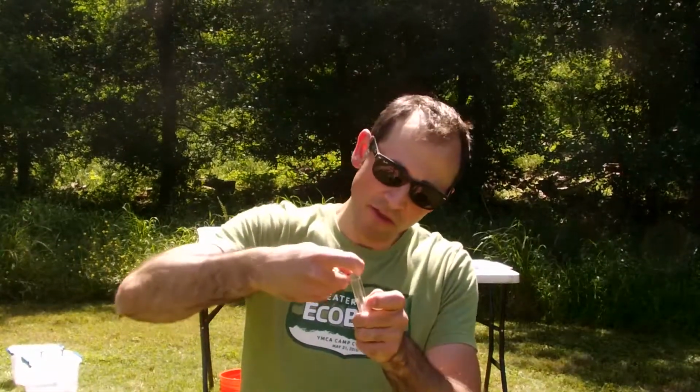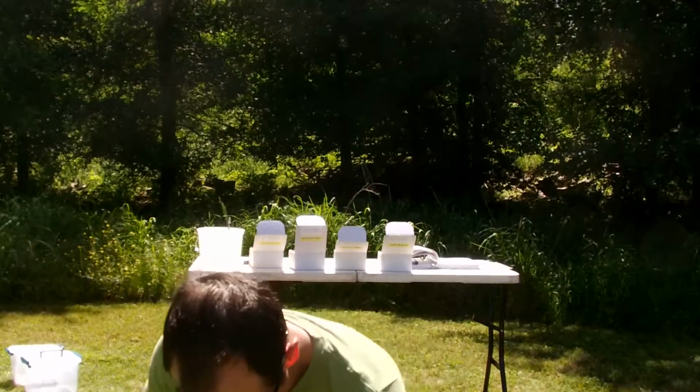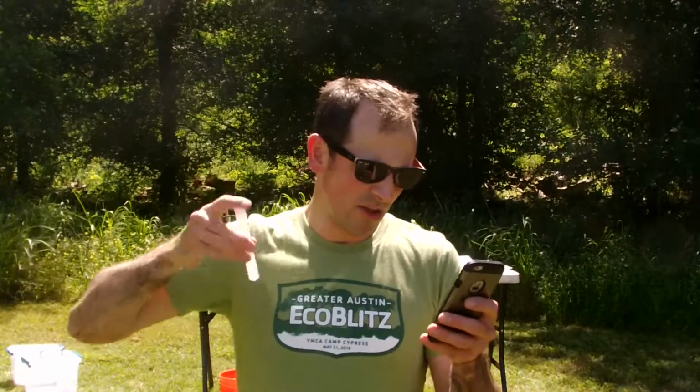Also, we don't want the kids to get this stuff on them, but they're going to wash their hands before lunch anyway, so it should be okay. Same type of thing. Use your foil pack, punch it out, get it all the way in there. Cap until it's disintegrated. And then once it's disintegrated, you're going to start your timer for 5 minutes. I think what we're finding out with these tests is it's not quite taking the full 5 minutes. However, you have the luxury of doing that only because we want this activity to be taking 20 to 25 minutes. As the kids rotate from activity to activity, they're going to be very close, so if you run over a little bit, you'll probably be okay.